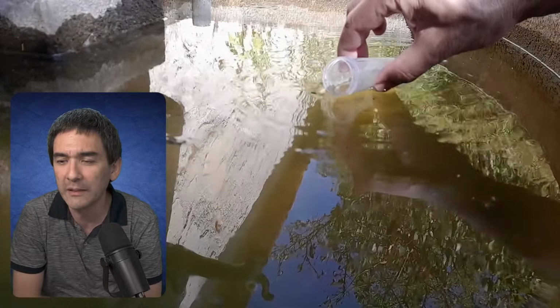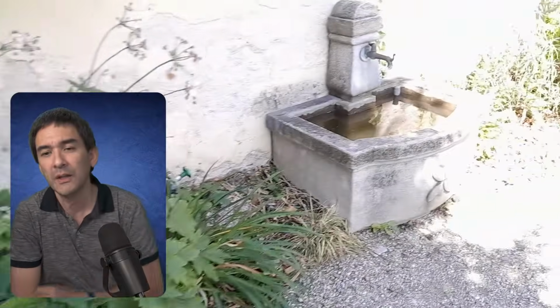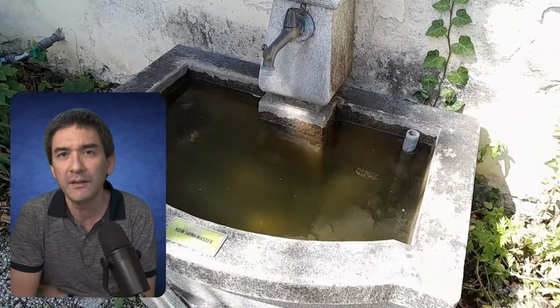The ponds where I collect my water samples almost never have Scenedesmus. Lots of Spirogyra, on the other hand. Could that be a water quality difference? Yes, of course. Depending on the type of organisms that you find, they can sometimes be so-called indicator organisms. This basically means that the organisms tell you something about the water quality, the amount of nutrients present, oxygen concentration, and so on.